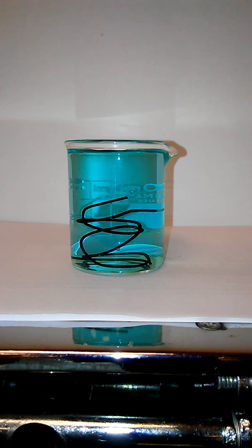quite significantly. This one here was the same clear solution that this started out with, but this time we have iron metal reacting with silver. The silver is not quite as thick or obvious here, one, because it's only been going for a period, and two, because this reaction is a little bit slower. I think it's also because I'm using steel instead of true iron.